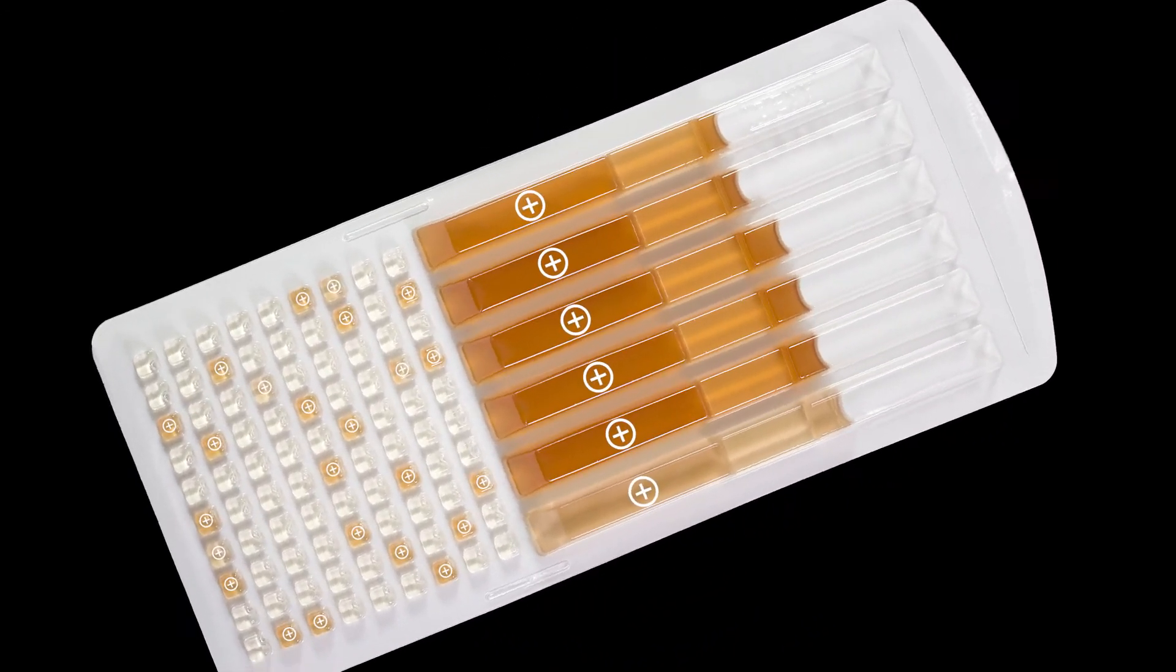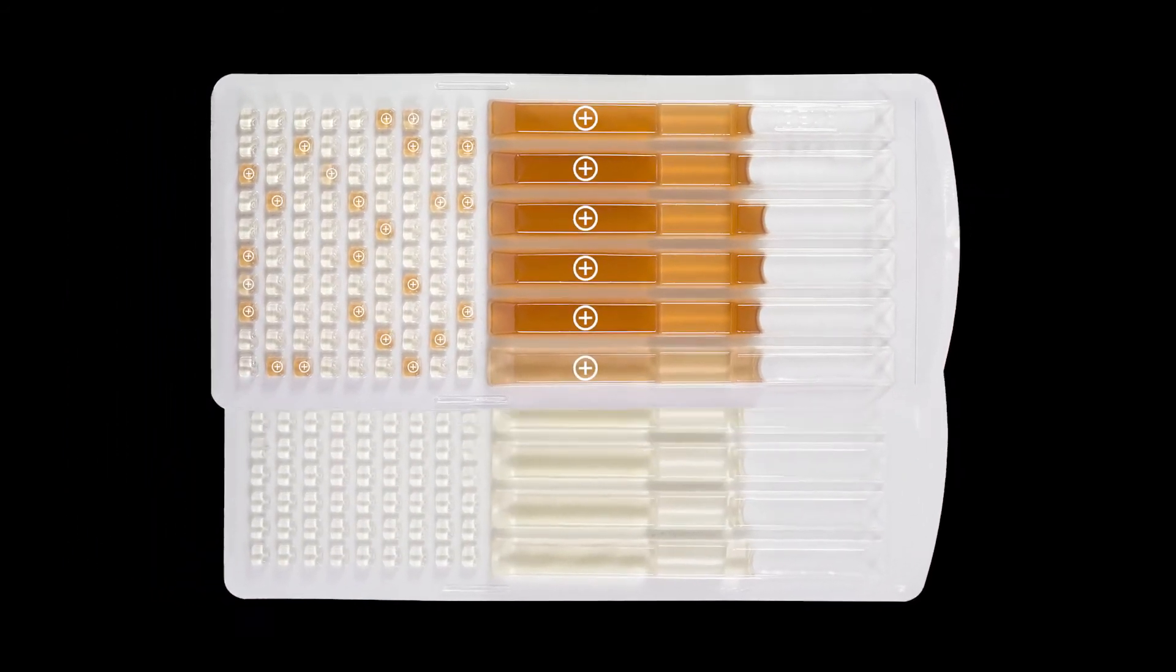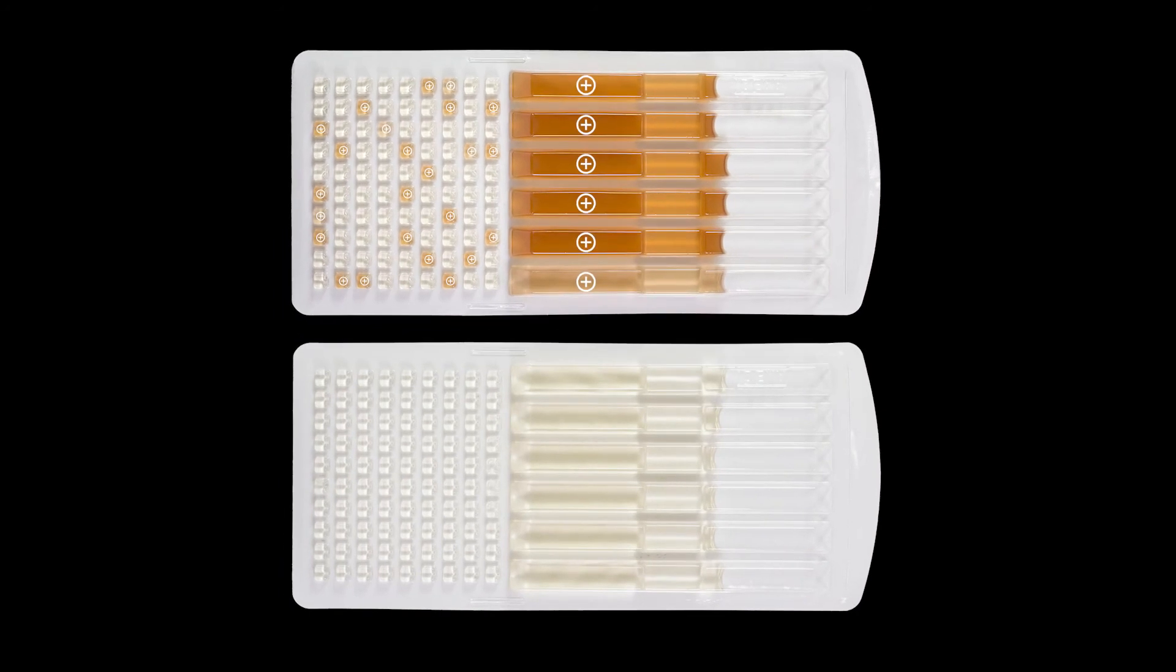Here is an example with both strong and weak positive wells. There are a total of 6 positive large wells and 24 positive small wells. If you're unsure whether a result is positive, compare the sample side-by-side with a known negative sample.